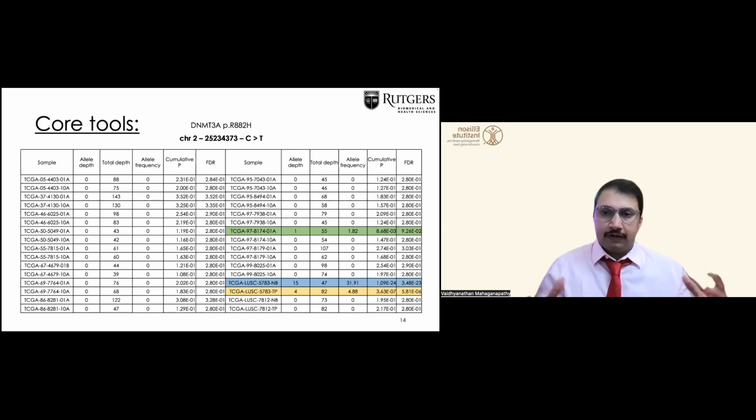So this is the whole crux of using MERIT and Backtrack. We cannot use any other variant caller for our approach because most variant callers might filter out that green read, that 1 out of 55, due to either low quality or low call, and also we won't be able to capture all the information of no reads. But because MERIT is designed to be agnostic and it calls any and all variants that it sees, we can use that information and find out the distribution of the alt reads across all the samples. Then we can use Backtrack to create noise models for each and every mutation, which will help us identify what are putative CHIP mutations.